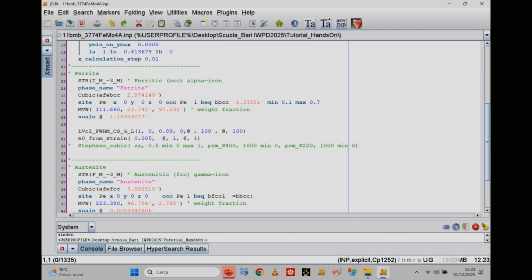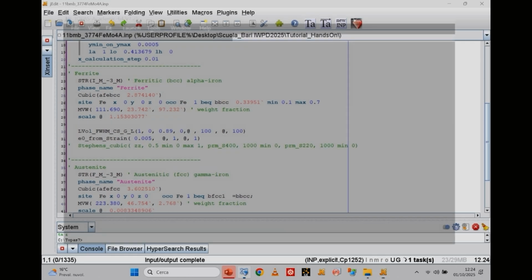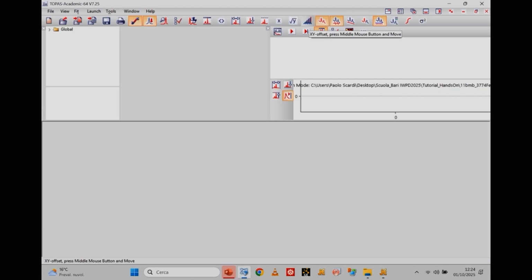If you use jEdit, I still use jEdit and not yet the other editor, I forgot the name, which is advised for TOPAS. It's easy because if you organize it the way John Evans shows, you can find the YouTube instruction, you can just click this one and this, and you transfer this input file to TOPAS.